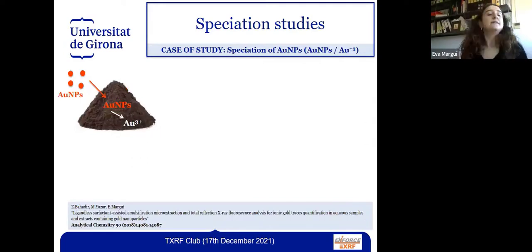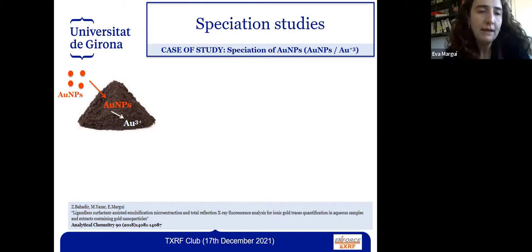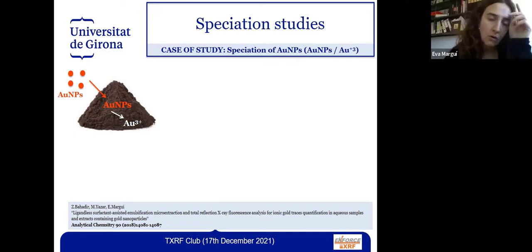And finally, the last example that I want to show you is the study that we performed in 2018. In this case, we were interested in studying the transformations that gold nanoparticles can suffer when they are introduced in the soils. As you know, metallic nanoparticles are emerging contaminants that can be introduced in the environment. And sometimes when they are, for instance, in contact with soils, due to the soil matrix, these gold nanoparticles can be transformed to the ionic forms.